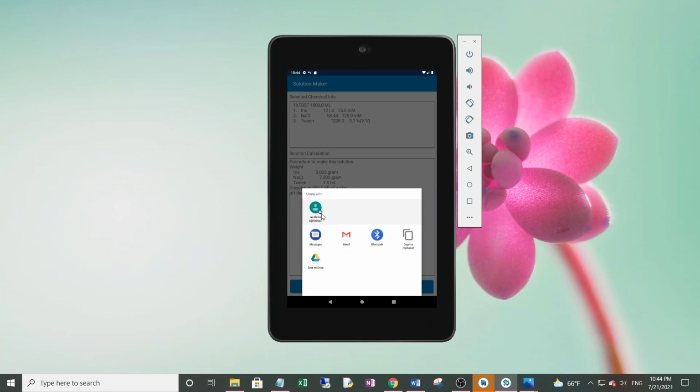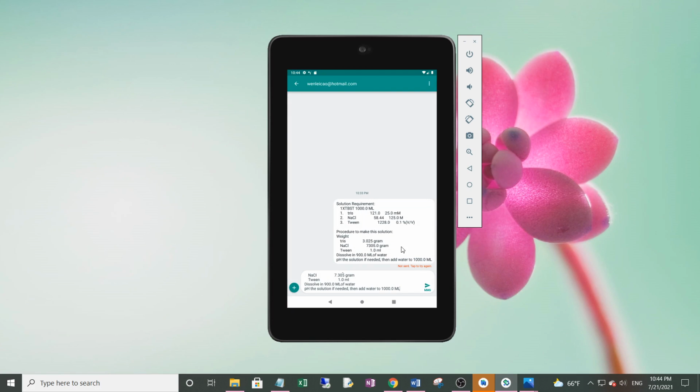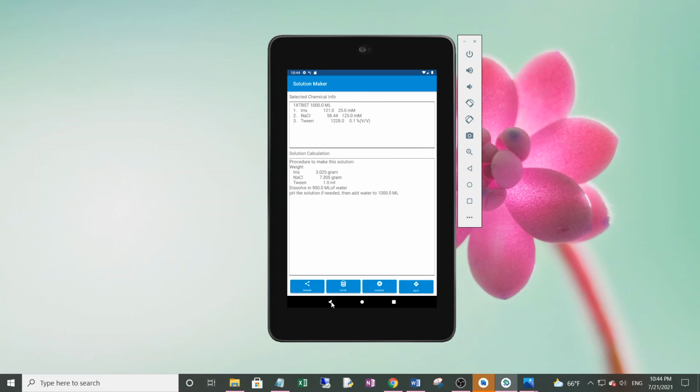In this case, I send an email to myself. Okay, sent. This one is actually a dry run. You can also share to a printer, so it's basically printed out. I don't have a print option because I use an emulator to take the video.